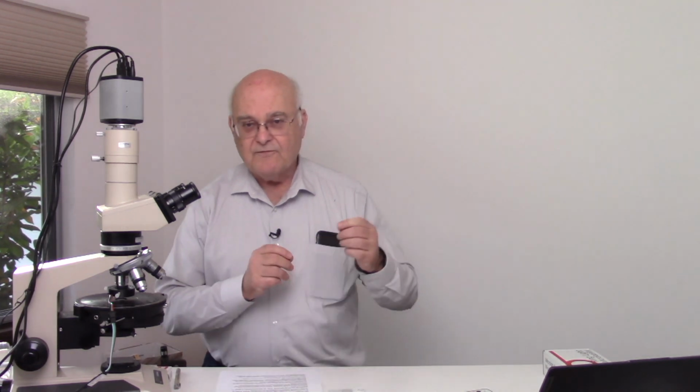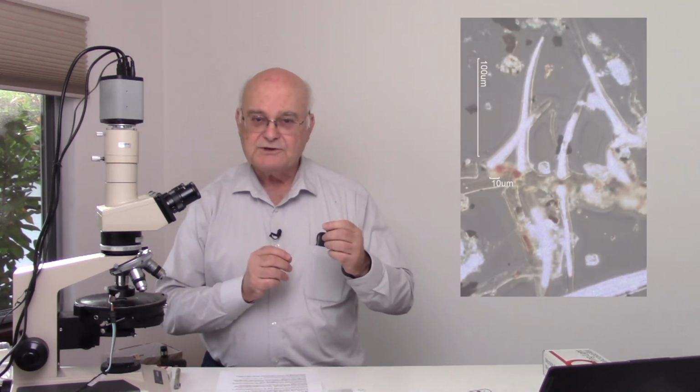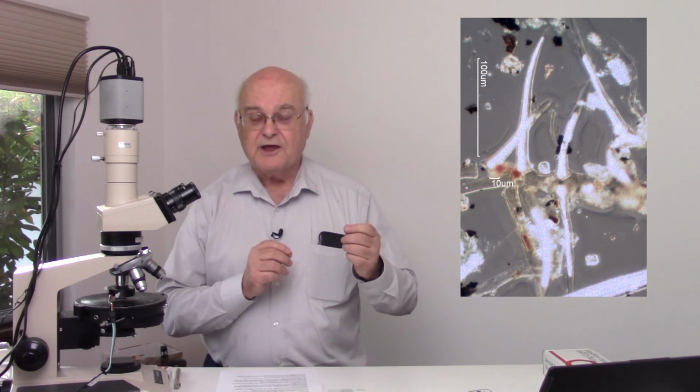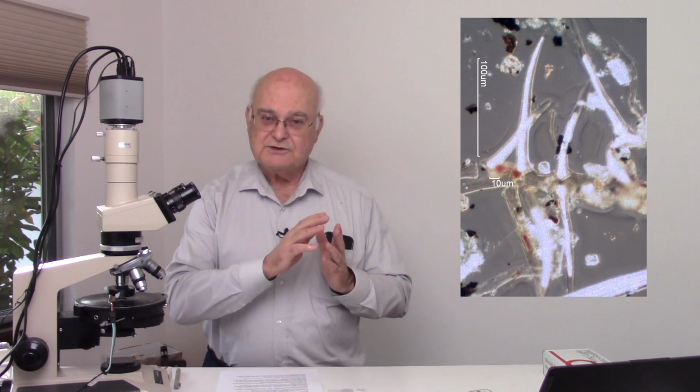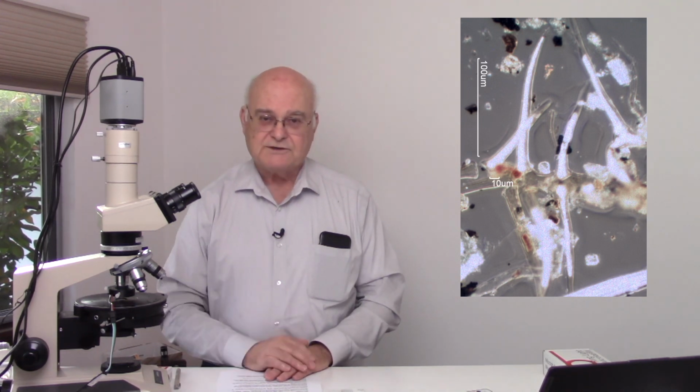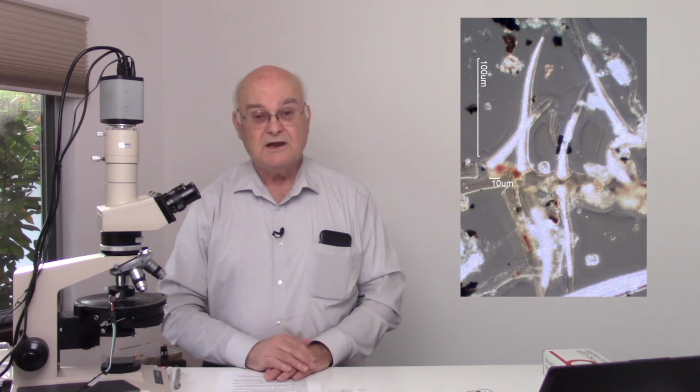These are protection for the grass. You also have elongated fibers. They're trichomes, is their technical name, but these are the hairs that grow off the surface of grasses and many leaves. These silica phytoliths survive the fire.